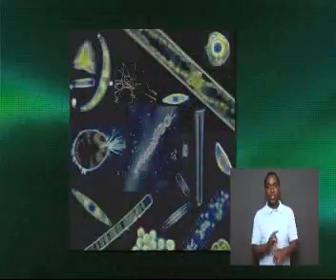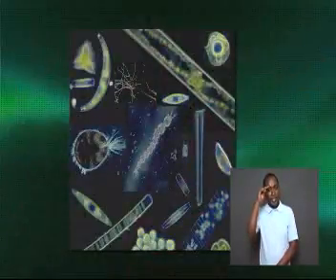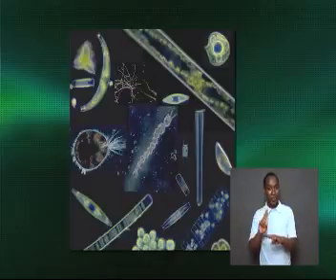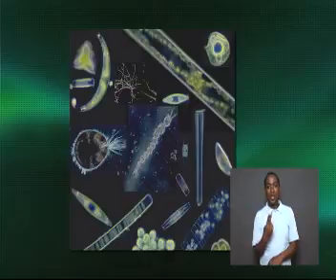When using a light microscope, information about the specimen is obtained by using the light in different ways. Dark field illumination is a method where the background is dark and only the specimen is illuminated. This is useful for showing smaller structures within the specimen.